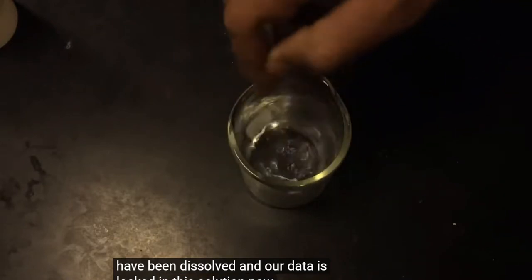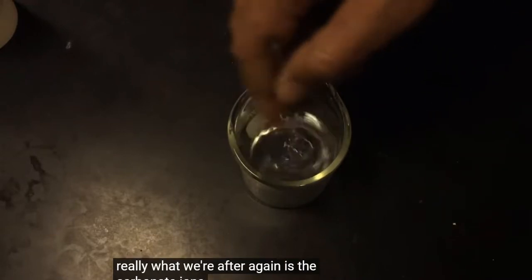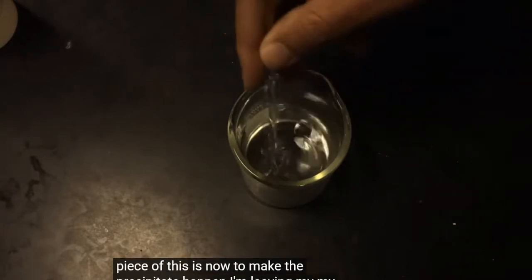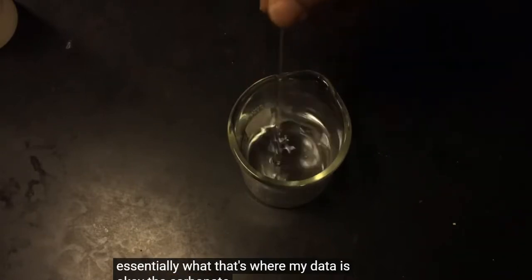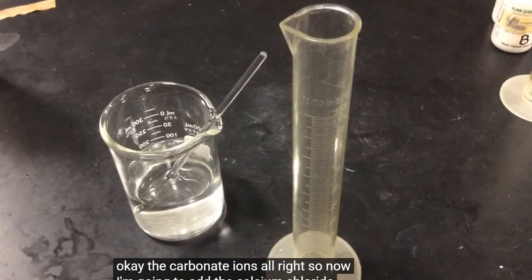Really, what we're after again is the carbonate ion. The next piece of this is now to make the precipitate happen. I'm leaving my stirring rod in here because that's where my data is, the carbonate ion. So now I'm going to add calcium chloride, which we know is also very soluble.